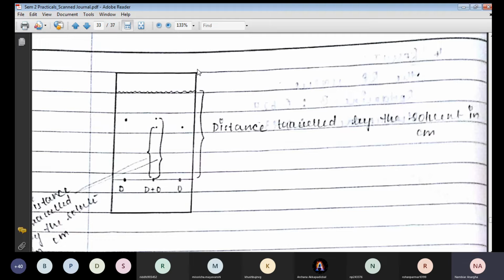In a tightly closed environment, iodine vapor interacts with our organic molecules, those are domperidone and omeprazole. We get the spots, and thus we can calculate the distance traveled by the solute and the distance traveled by the solvent. So this is very much easy, right? Nothing is like rocket science, I guess.